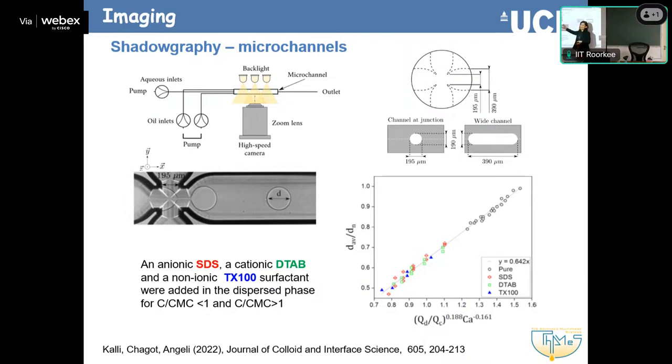You can do it with gas-liquid, with liquid systems. You can do it with all types of phases. This microchannel I'm showing you here is slightly different to the T-junction you had yesterday. We have a co-flow configuration. And you see some results here, and some details on the geometry of this channel. It's a commercial one, and it's not entirely circular when you go to the main section. There will be some images, so if people want to come closer, that's okay.